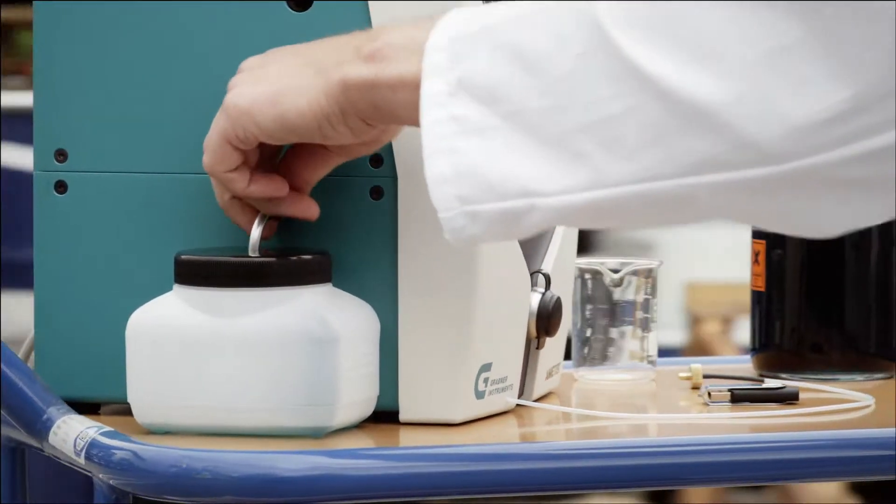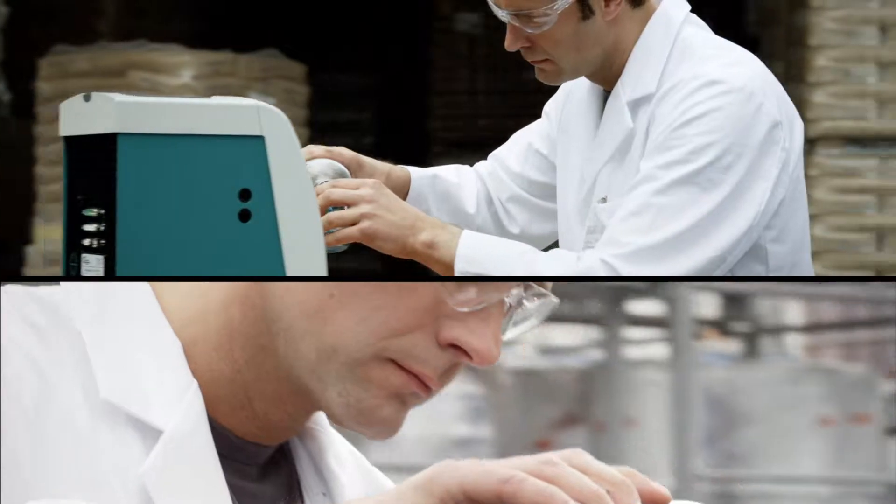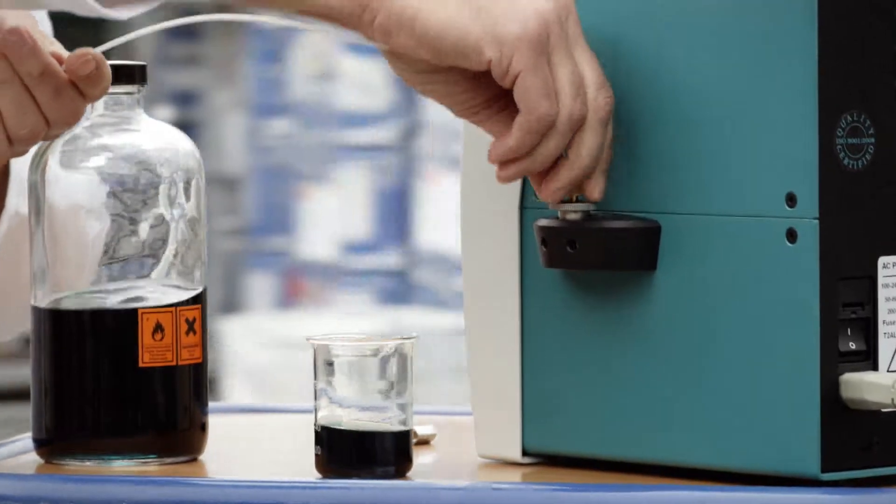The VP Expert is a versatile tester for petroleum products and chemicals. Small and portable. Ideal for testing in the lab or in the field.